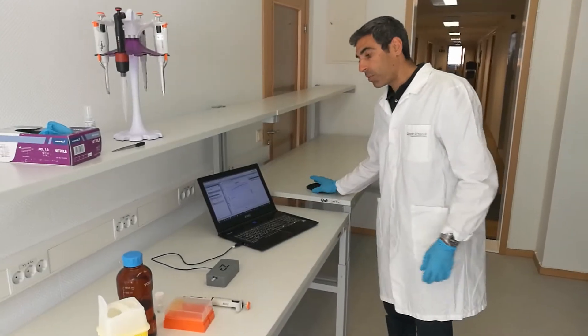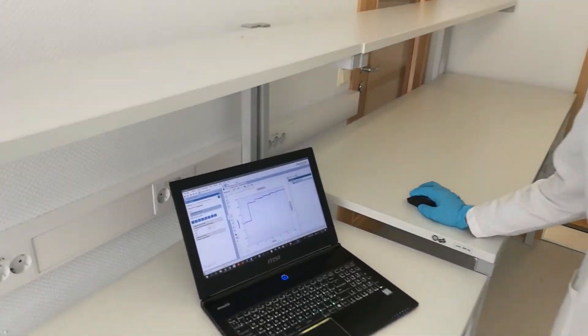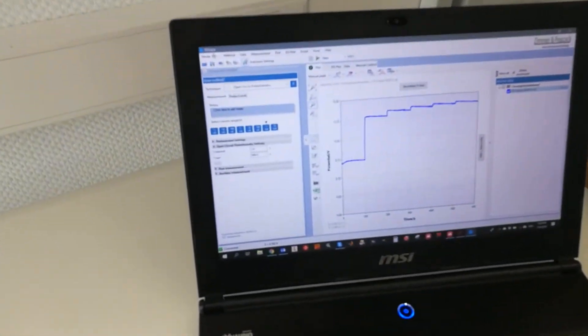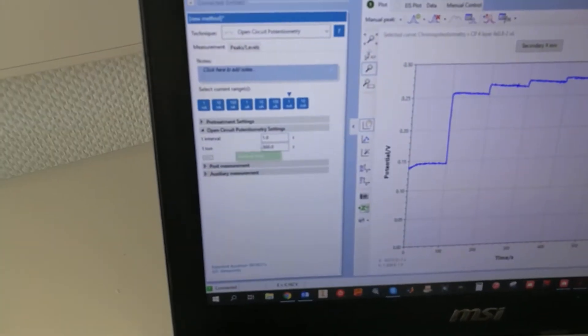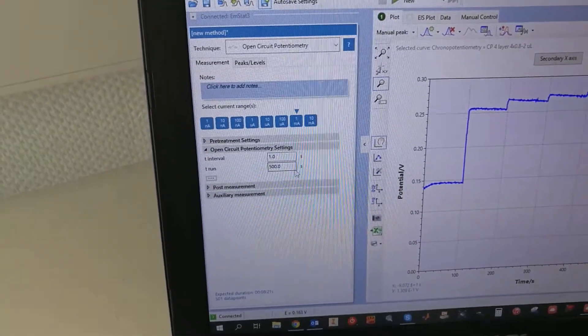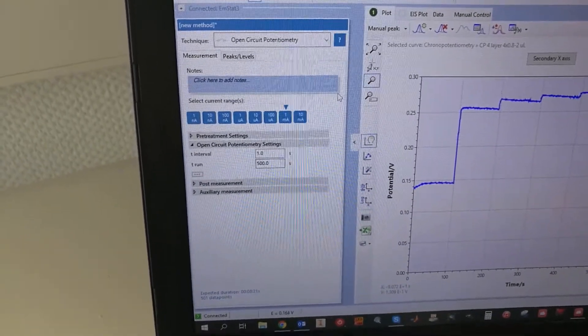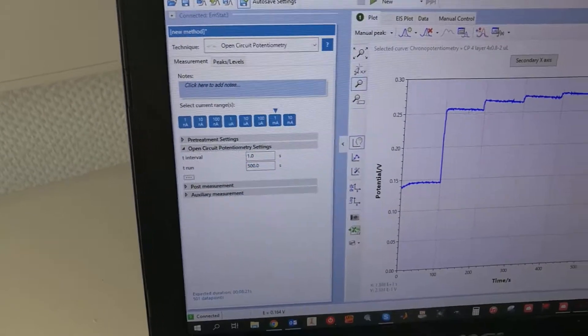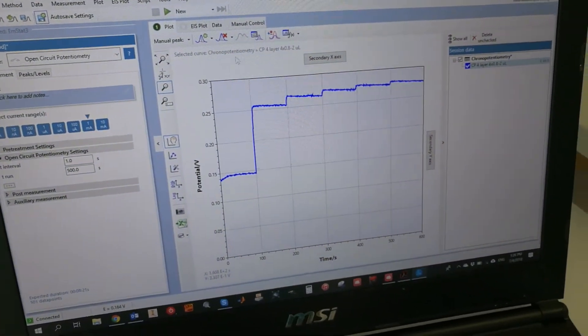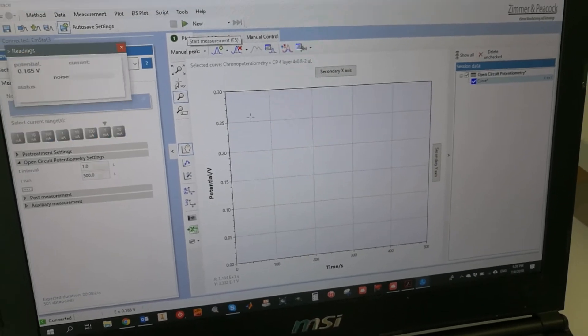The potentiostat is connected to the PC. I'm going to start running. I'm using a sampling interval of 1 second, and I'm going to run it for 500 seconds - in this case it could be 100 seconds, just to show. This is a typical response to different concentrations of potassium for this membrane thickness. I started running.